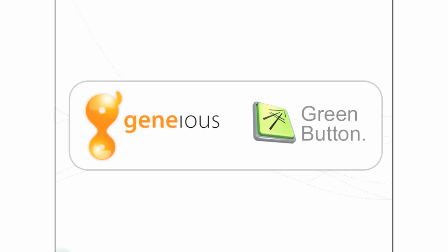Green Button is a new plugin that builds the power of a supercomputer into Geneious. It allows you to complete intensive analyses in a fraction of the time it would normally take you, and it's just as easy as running the analyses on your desktop computer.